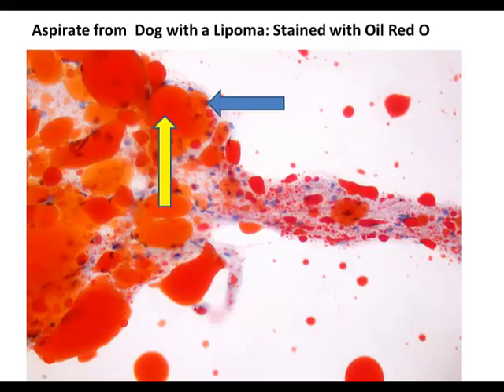And here we've got some of these cells that are residing in this mass on the dog. This mass was a lipoma. This is a benign type of tumour, so an overgrowth of fat cells, which is why we've got so many fat cells to look at here, which is nice to make the point that I'm trying to make here, which is that by dealing with this material differently, by not putting it through the normal processing, we are able to stain it with a different stain.